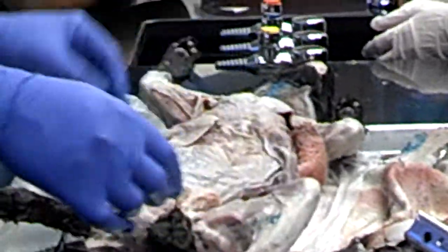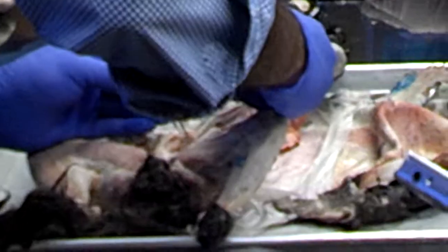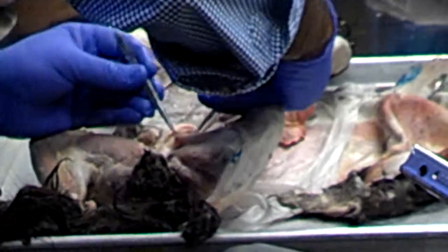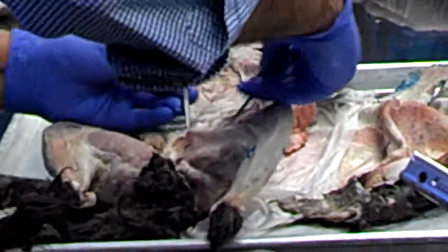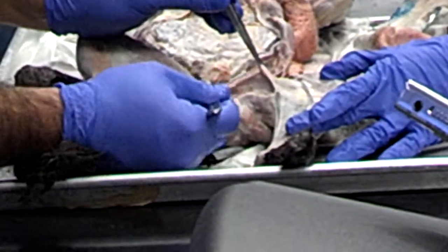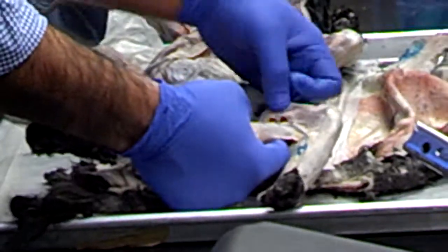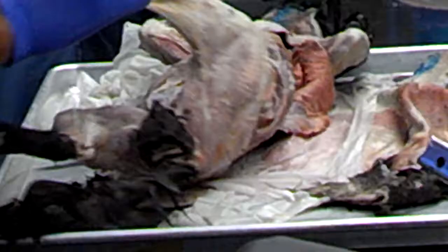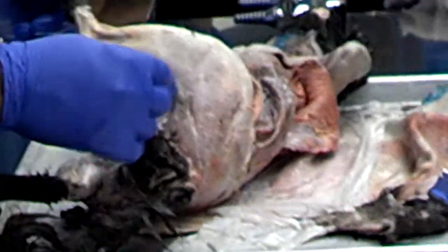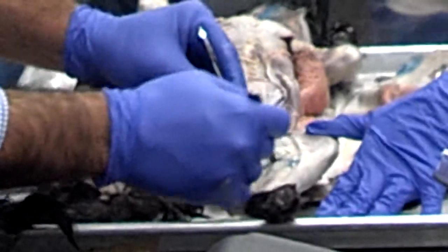Sartorius, and this is your gracilis, and I'm going to lift it up again right from here. I'll use the back side of my scalpel blade and we'll separate it. And I'll separate it right from here. Okay. So this is your gracilis. Sartorius and gracilis. And right here, this muscle is your calf muscle, gastrocnemius. And you can separate it. I will show you later on. You can lift it up. Hold it down. I'm going to remove this sheath of muscle from here to expose that.